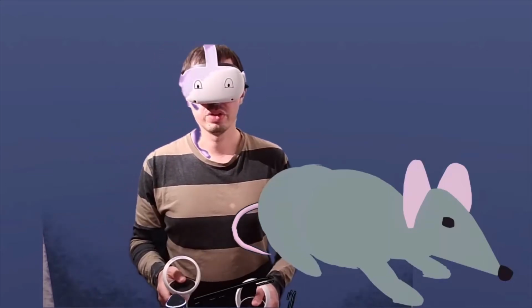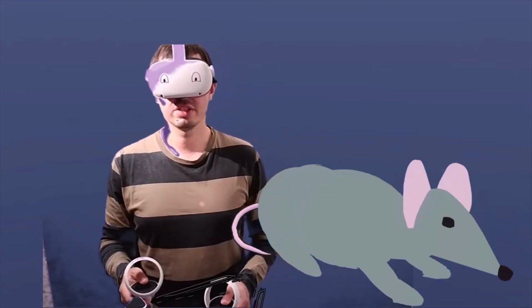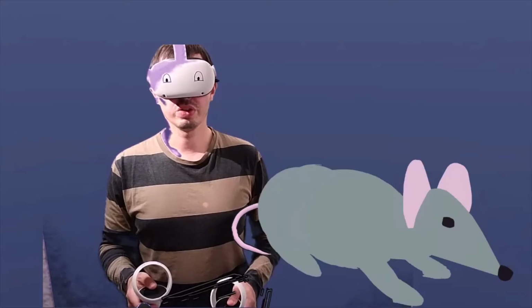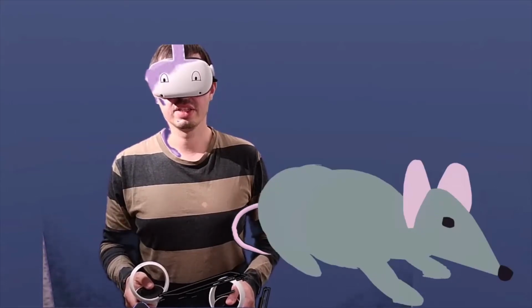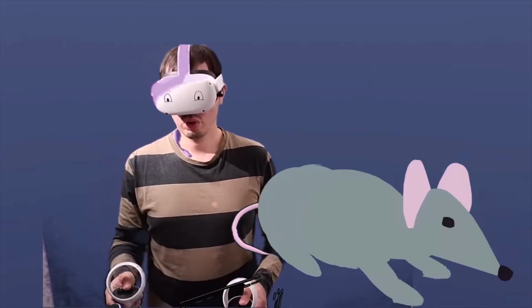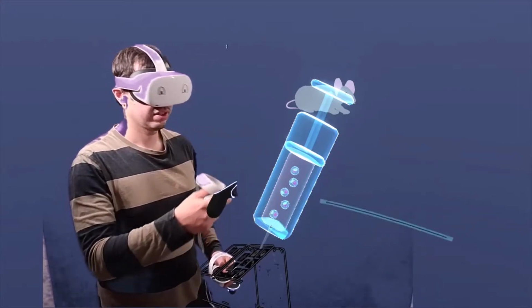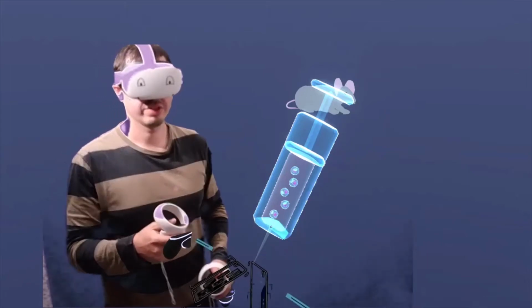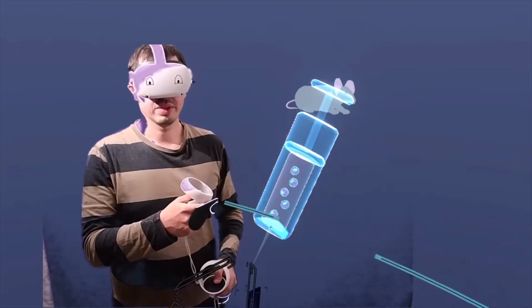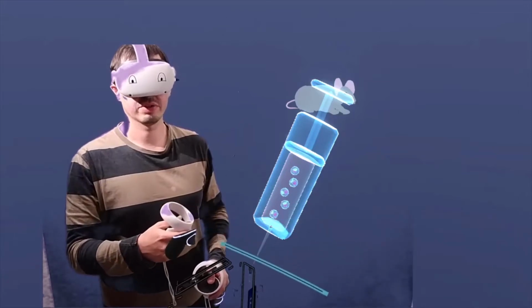So you have your mouse. Your mouse has billions of B lymphocytes. B lymphocytes are the cells which are responsible for the synthesis of antibodies. What you want is to select the few antibodies that actually relate to the antigen that you've injected. But you can't choose. Once you get your cells inside the syringe, you don't have access to what these cells are directed against. So you have to find a way to split these cells to be able to choose which one is the best for your treatment.